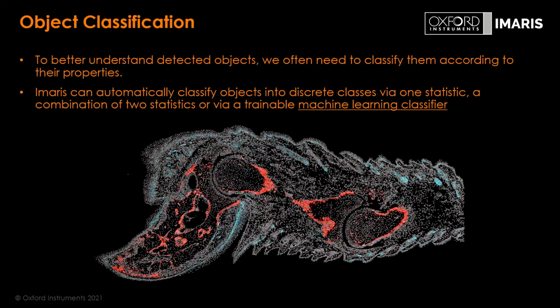One form of object classification. So in terms of the classification, we have three different types of classification: two regular ones, which are 1D and 2D filter, and one machine learning based classification. So this is machine learning based classification. This is just an example. So we have this brain slide here. I think it's a brain slide or not.